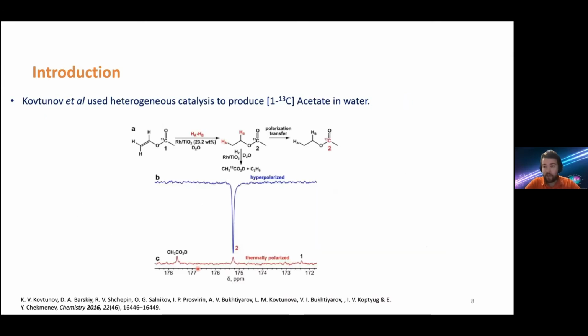And we've also seen from a presentation by Dr. Oleg Salnikov that he and Kovtunov and co-workers have also produced carbon-labeled 13C acetate in water that's been hyperpolarized using this same method. And in that talk, we saw they also have done a whole host of molecules and really expanded the library of molecules that can be used.